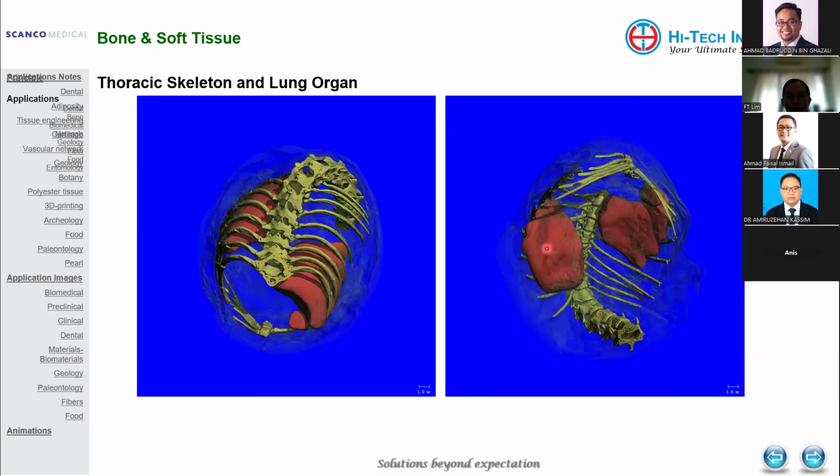So the software will have the calculation, the baseline, the threshold, up and down, and it will capture at the standard time, standard rhythms, so that it can all compile together and give you the image of the lung, even in a live animal. Same goes for a cardiac heartbeat. So that's for the in vivo MicroCT.